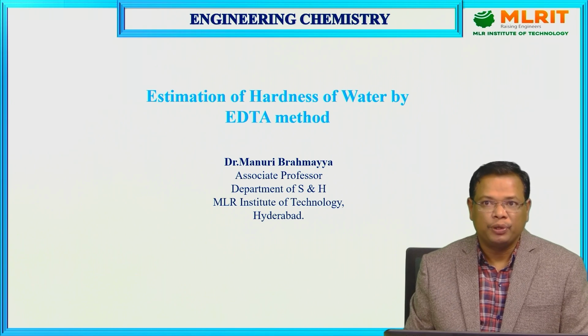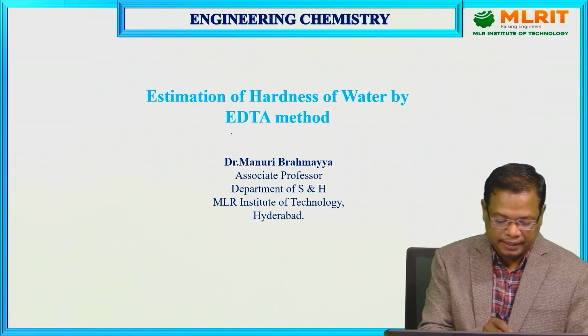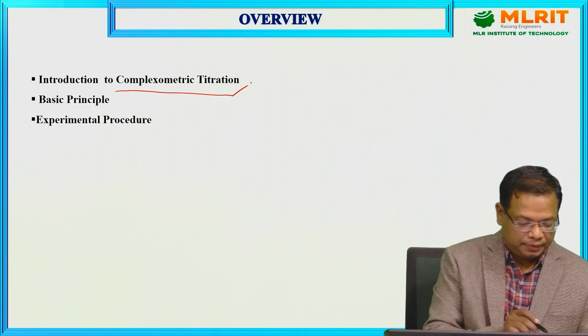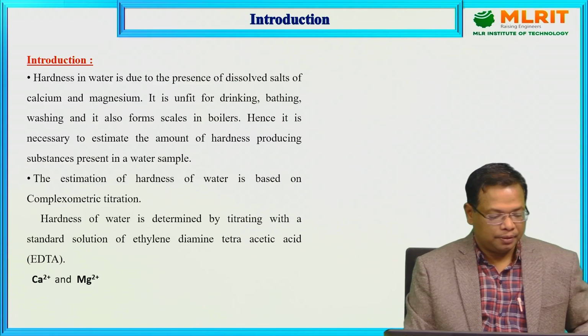Today, I am going to talk about estimation of hardness of water by the EDTA method. Overview: introduction to complexometric titration, basic principle, experimental procedure. So, introduction.